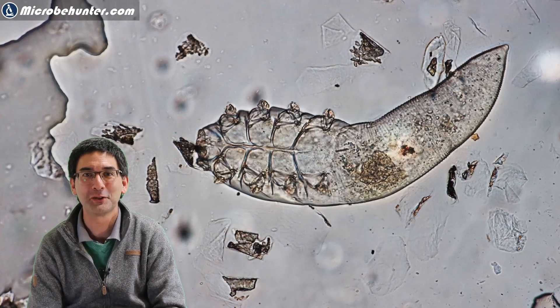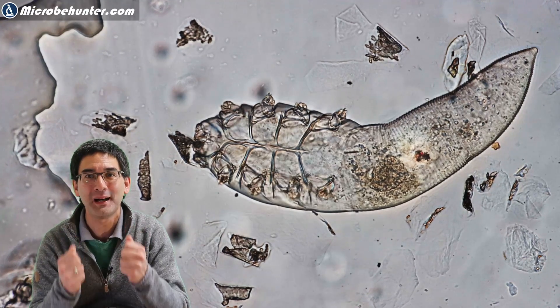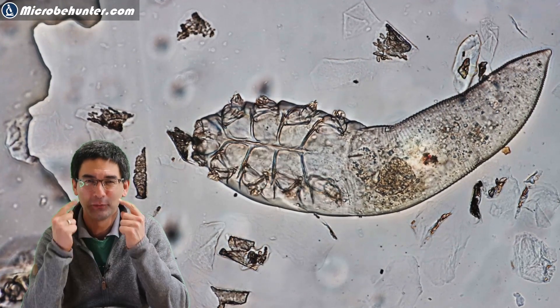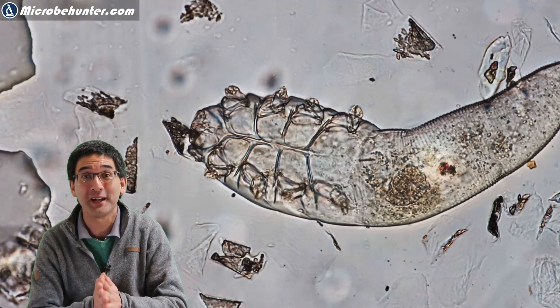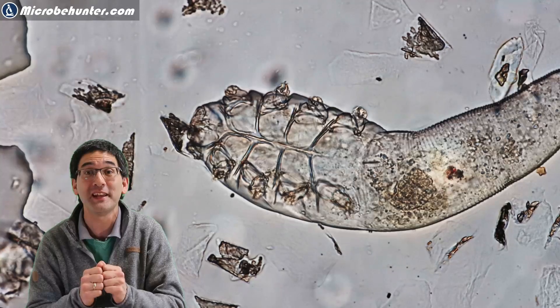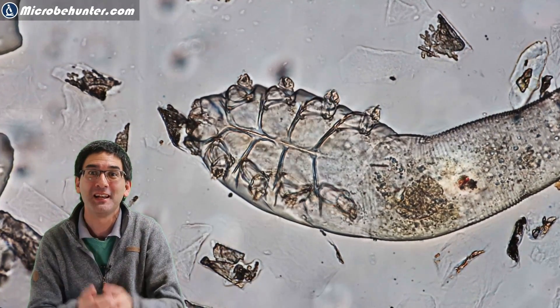Hi, hello and welcome. Microbe Hunter here. This little critter is a face mite which I extracted from my face, and today in this video I'm going to show you how you can also do that — how you can also hunt for these face mites on your forehead, on your nose, and also on your cheek.